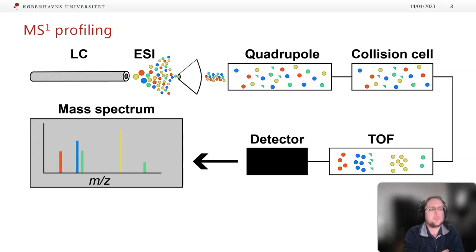There can be multiple ions that correspond to the same compound because of the in-source fragmentation, but also because of adducts. We will explain adducts more in detail later, but it means that instead of just ionizing by removing or adding a proton, some compounds can also ionize together with other atoms. Typical atoms are sodium, potassium, and chloride. Since they have a different mass than hydrogen, you will see also multiple peaks in your mass spectrum.